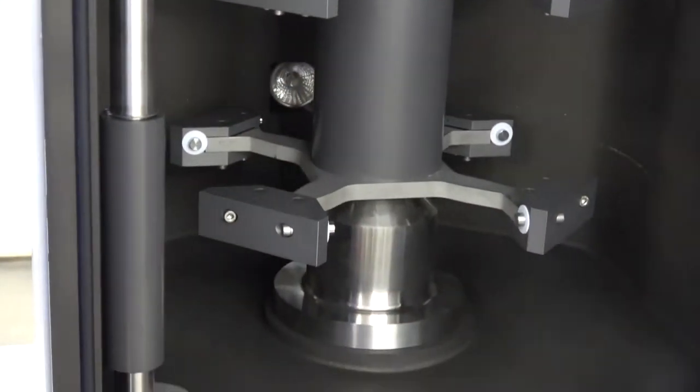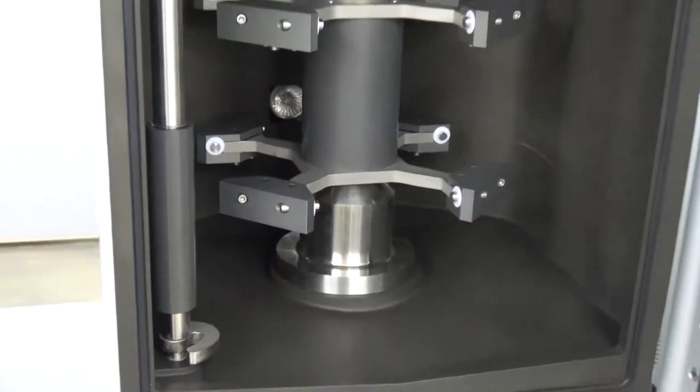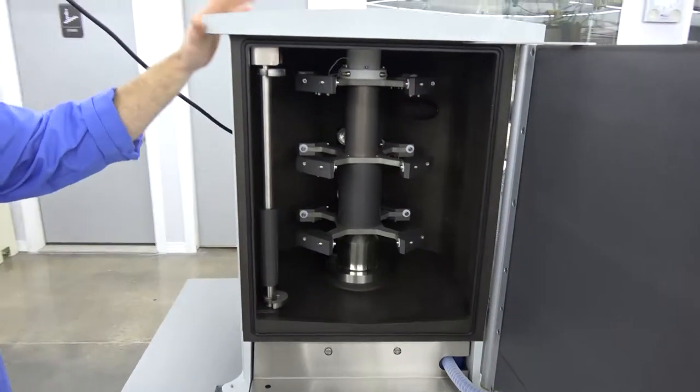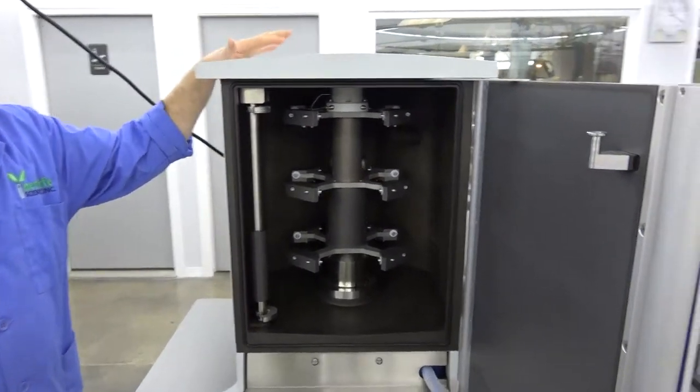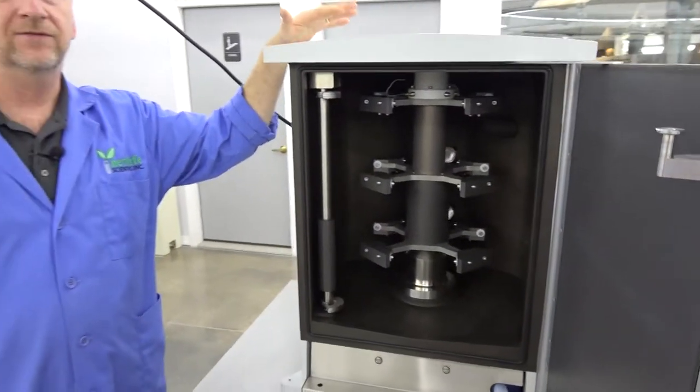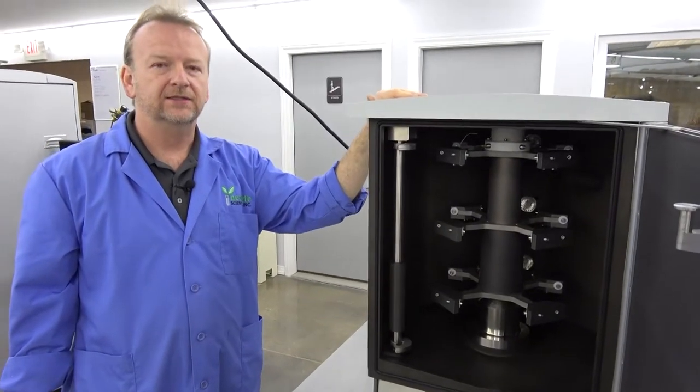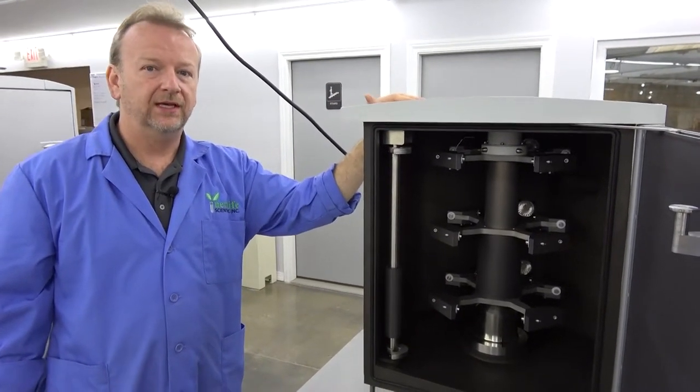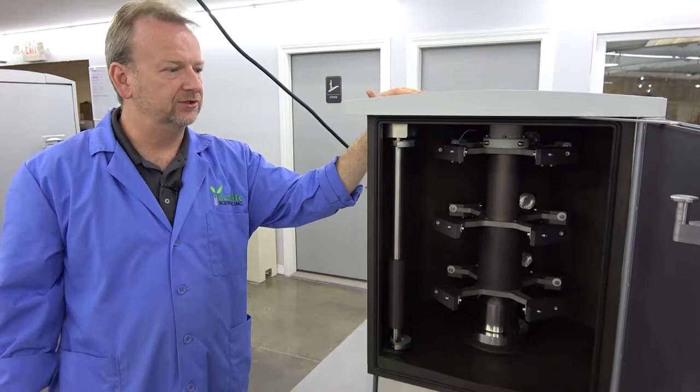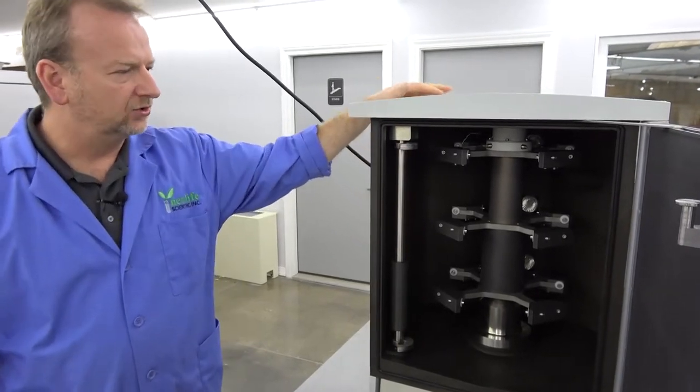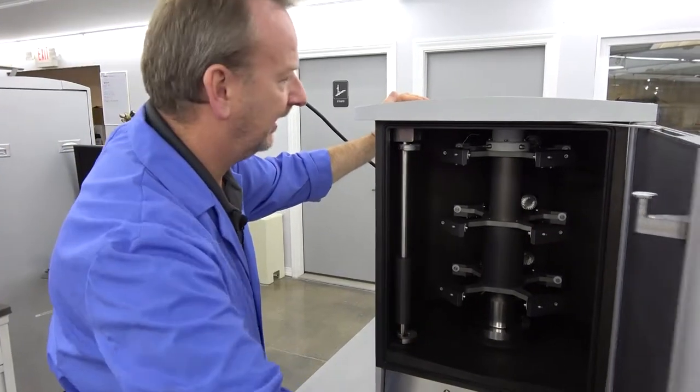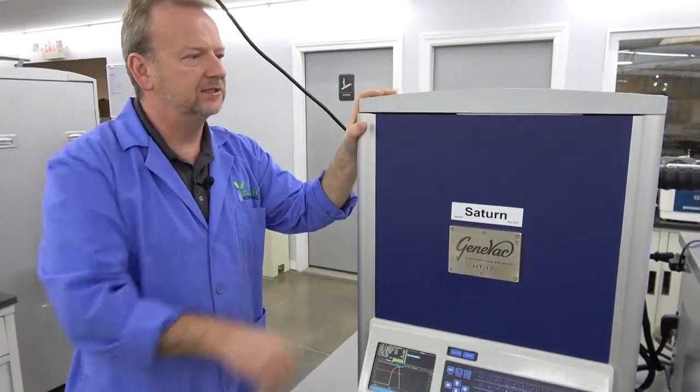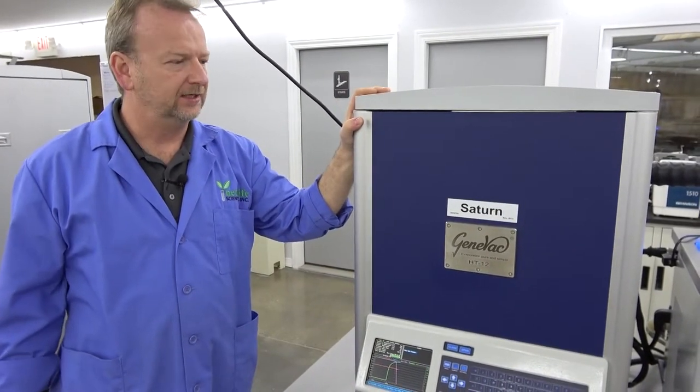It's in great shape. It's a turnkey system. Beautiful. Just never seen, I have not seen a used one this clean and this beautiful anywhere on the internet. So you're getting one of the top best units as far as used. Here's your chance to get a quality machine at a reasonable price compared to a new one.